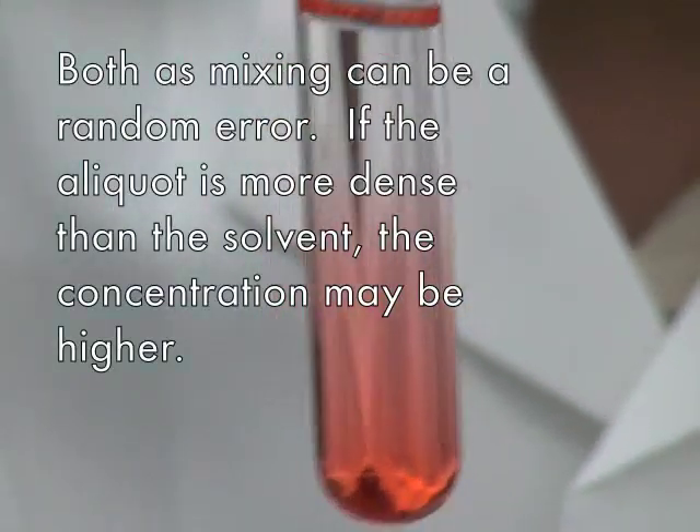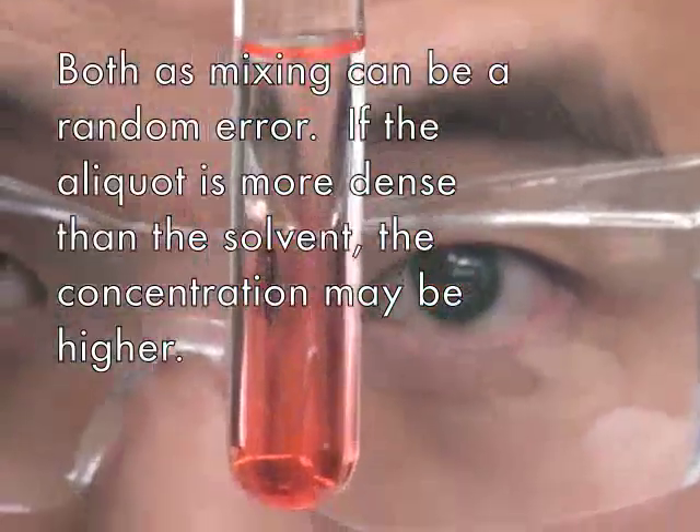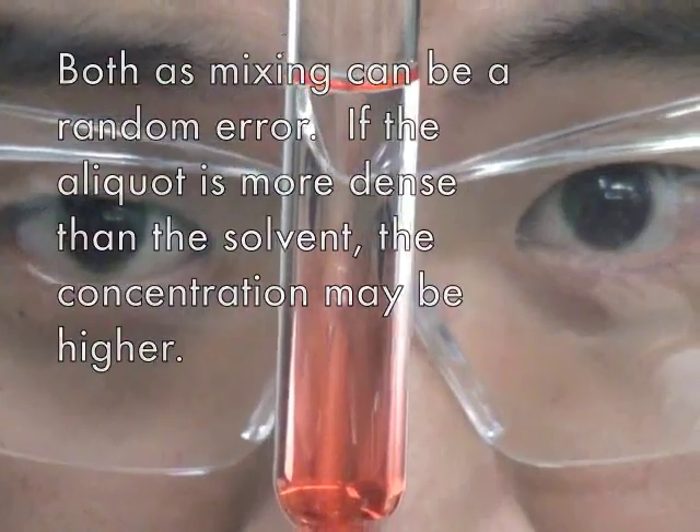However, if the aliquot solution is more dense than the solvent, the concentration may be higher as the spectrophotometer's path of light reads at the bottom of the cuvette.